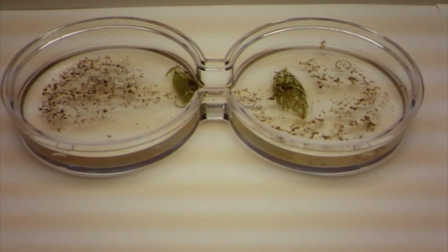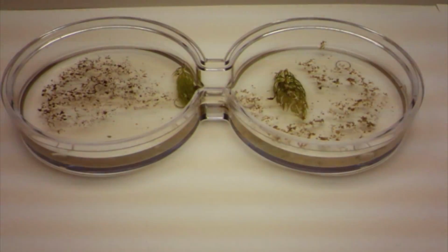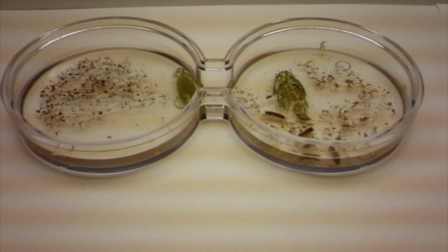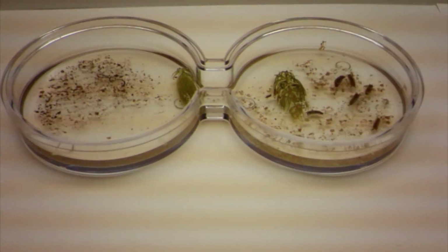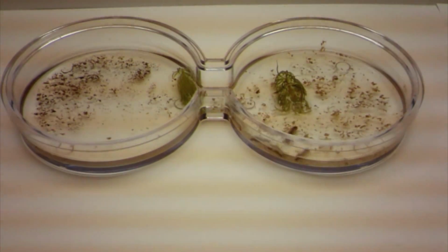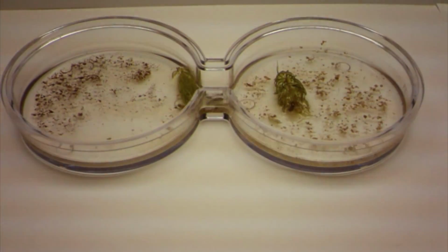The last experiment was set up with dried plant material on the right and crushed pieces of decayed millipedes on the left. In addition, we added living plant material on both sides because we saw the aquatic sow bugs had a tendency to engage the plants in the previous experiments. In this investigation, their activity was isolated on the right side after initially engaging with the live plants. This indicates that aquatic sow bugs do have a food preference for plant material, whether it's dried or living, over the pieces of decayed millipedes.